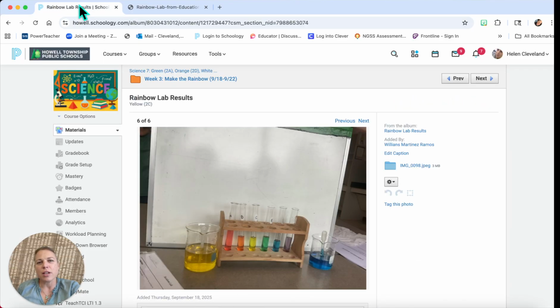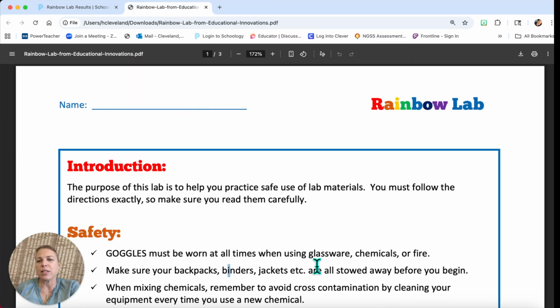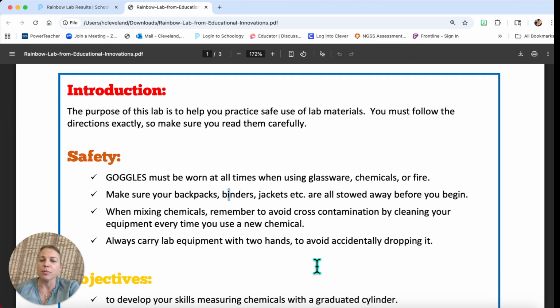This was provided by Educational Innovations, and let me show you the results first. When the students are done, one person per team takes a picture that we can analyze the next day. By just looking at the results, it's an easy way to see what groups followed directions, and you kind of see which teams were most precise. There's a certain amount that should be in each one that I could usually tell just by looking at the pictures. I just wanted to point out some little things here.